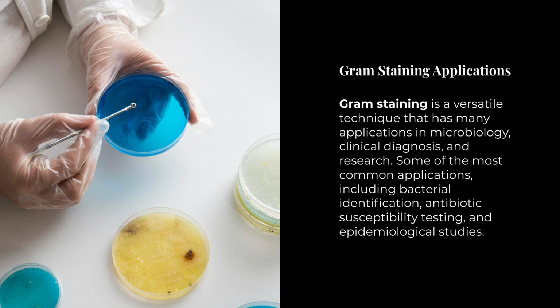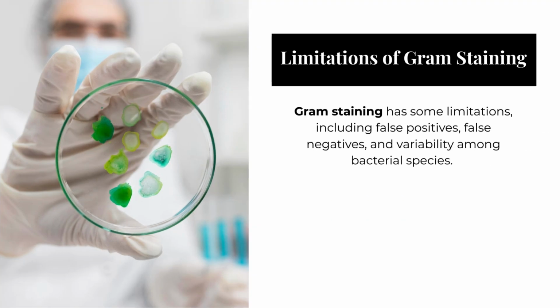Some of the most common applications include bacterial identification, antibiotic susceptibility testing, and epidemiological studies. Limitations of gram staining. Gram staining has some limitations, including false positives, false negatives, and variability among bacterial species.